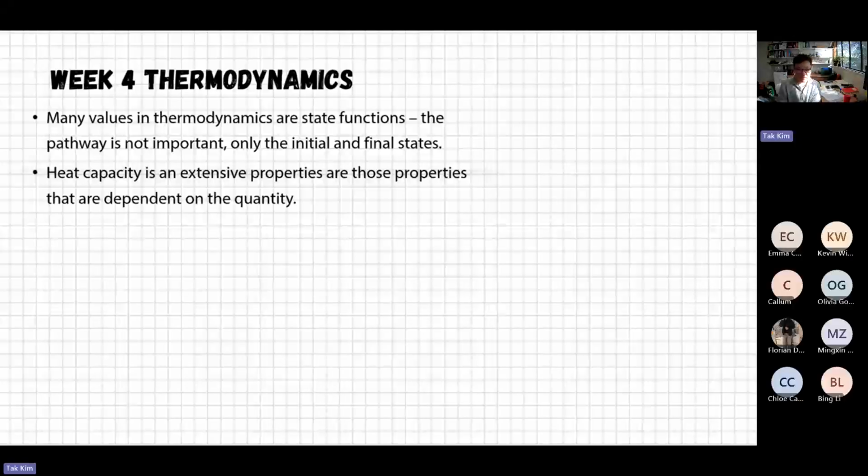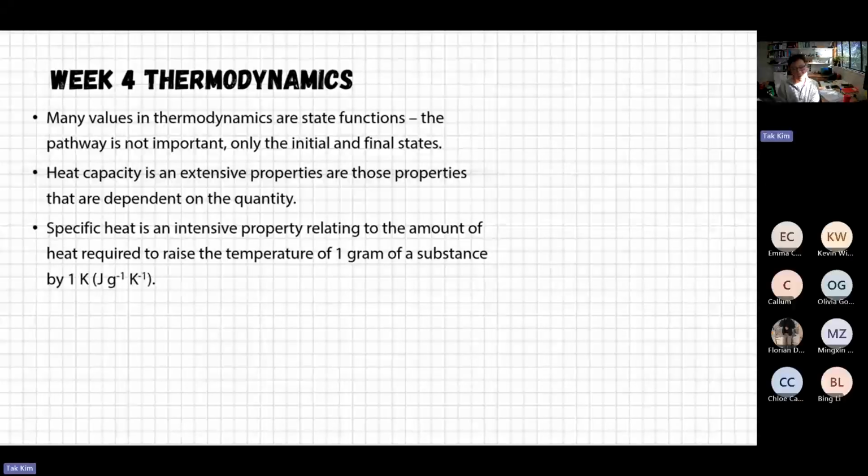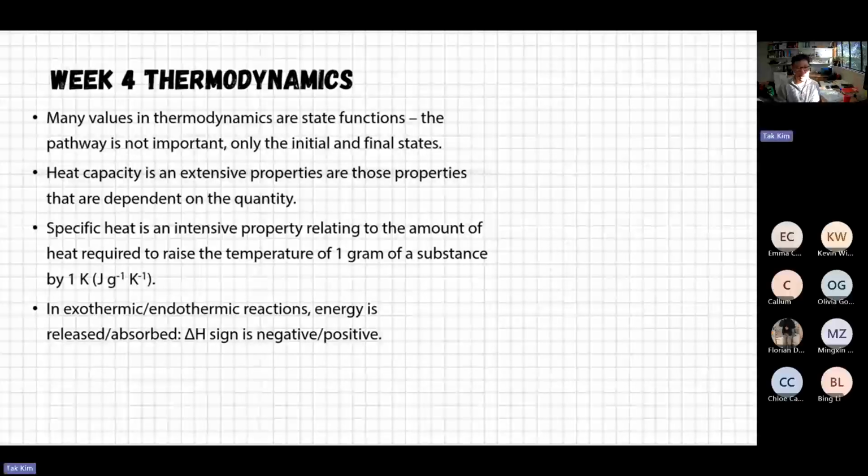All right. So when it comes to thermodynamics, although you spent some time measuring temperature changes, later you will see it is really not useful information. Although you could see some changes, you could see later on that is the reason why you had some errors, right? I will leave the readings to you, but the dot points over here will be a fairly important concept to go through the content in week 4, right?